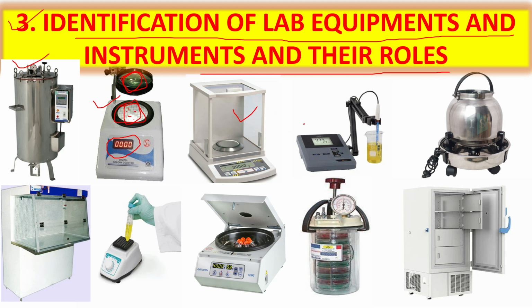Okay, so next thing is a pH meter. So pH meter is used to measure the particular pH of a solution or reagent or any microbiological media. Next thing is the fumigator. So fumigator is used to fumigate a room.